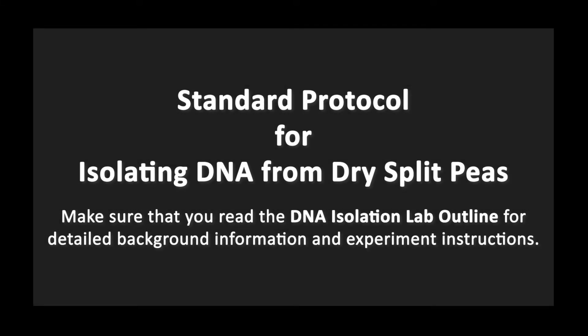In this video we're going to go over the standard protocol for extracting DNA from dried split peas. We're also going to see what happens to the DNA yield if we change one step in the protocol. We'll start by going through the standard protocol.